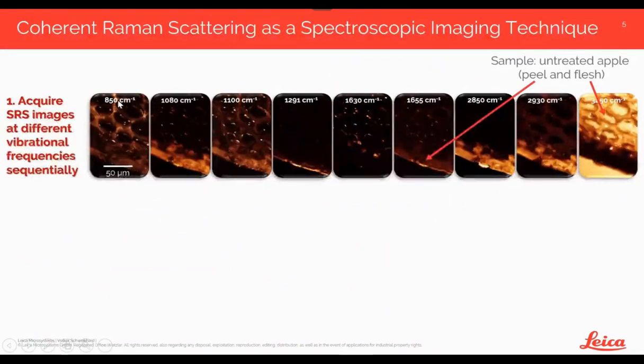And again, each image is taken after tuning the laser frequency difference by one step, and then by another step, and another step. And you can see here that the image contrast that is obtained at all of those vibrational frequencies is quite different, because different vibrational frequencies talk to different vibrational resonances in the molecules.